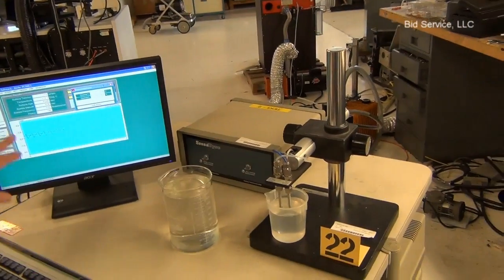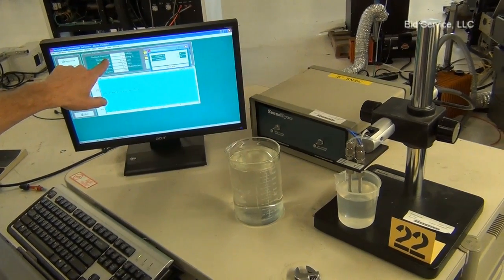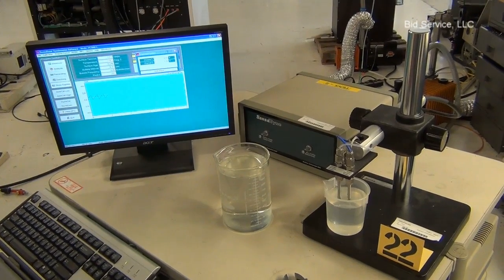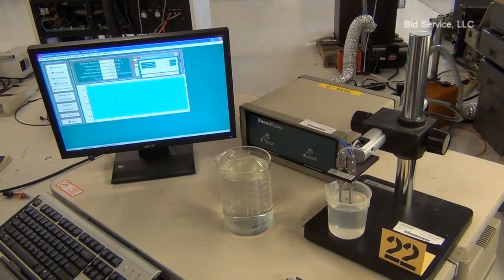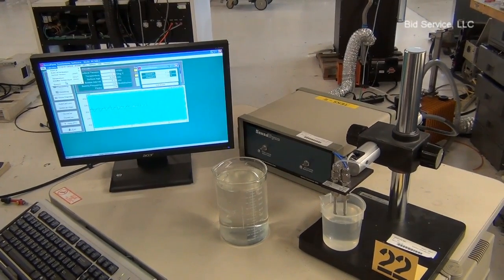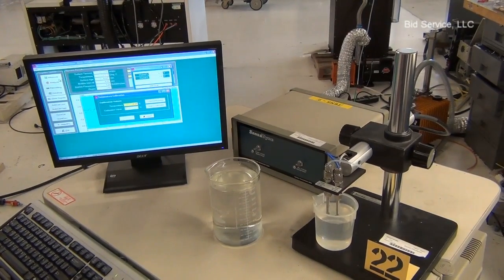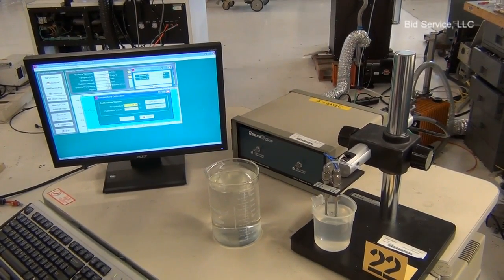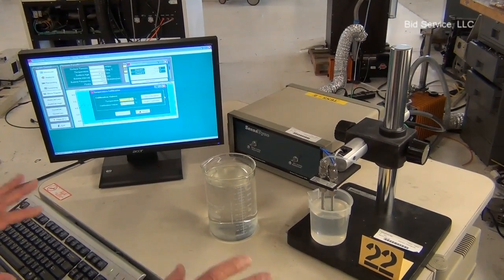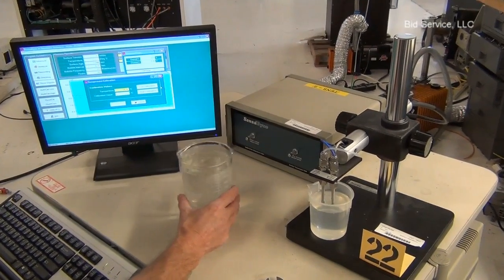I didn't do the calibration here — we're just seeing that there is a change; the alcohol has a surface tension reading that's different. You can also calibrate the temperature; that's explained in the manual. You'd have to do a low and a high temperature. I'm just running it to show that it's giving you a reading and you have control.